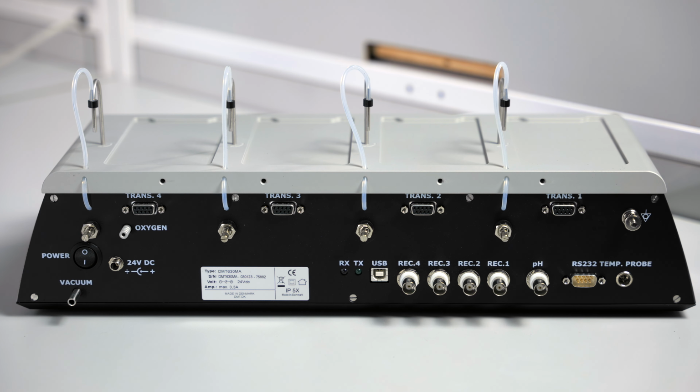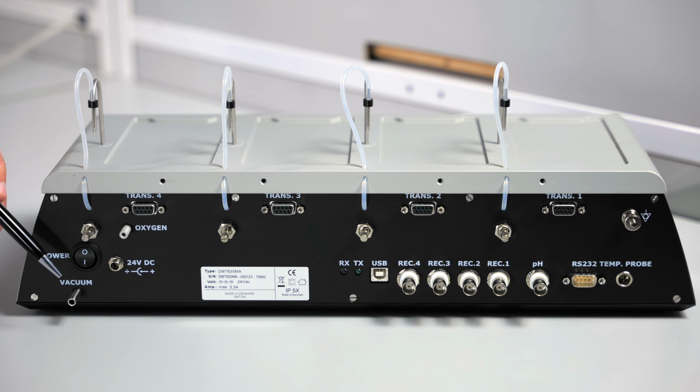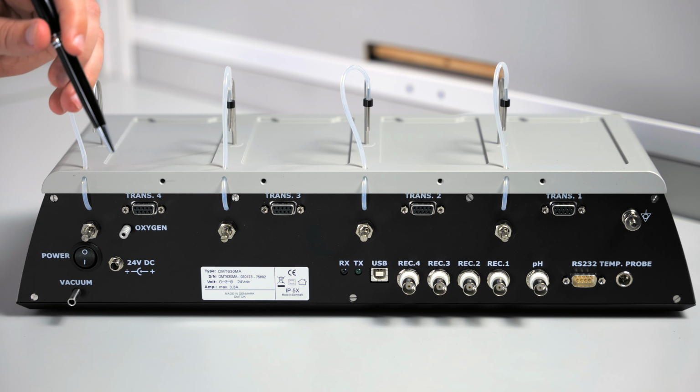The back of the interface has all of the connections needed to get the most out of your system. You have ports for your vacuum and your gas line. You have a connection for your power supply and your power switch. Each chamber has a connection for the force transducer, as well as a needle valve to control the amount of gas bubbling in each chamber.